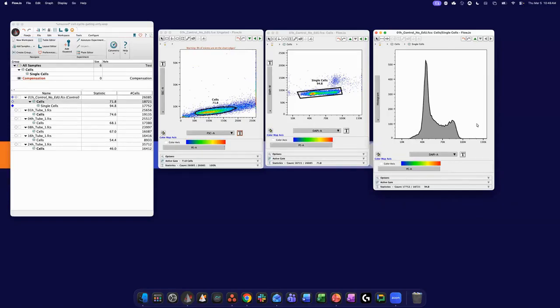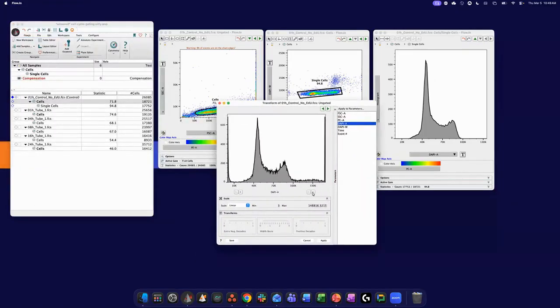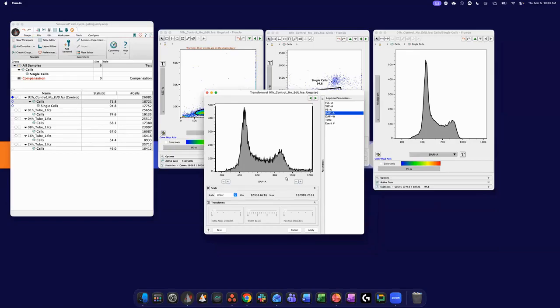If you have a lot of wasted white space here and you feel like you can't confidently see the S phase, hit the transform button, go to customize axis, and here you have an opportunity to remove or add range if you need it. And I will say this will dramatically help your modeling as well. Okay, because if you feed a model, which we're going to go through in just a second, really compressed data, it's just not going to fit very well, right? The model sees what you see. So take an opportunity to adjust the min and the max so that we get a nice range of univariate values and we can clearly see the twofold change from the G0, G1 to the G2M. Okay.